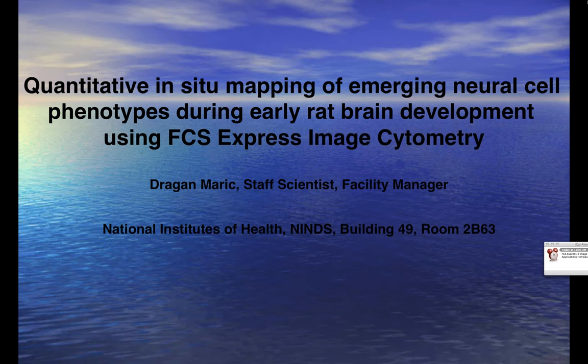As everybody has seen, Sean has shown what you can do with a single image and all the features that you can plot, extract, and do statistical analysis from in FCS Express. I'm going to extend a little beyond that and deal with a whole bunch of images generated from slide scanning of large areas on a microscope slide, like an entire embryo or tissues of interest.